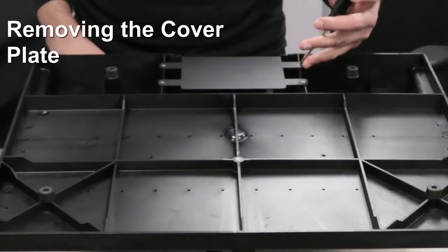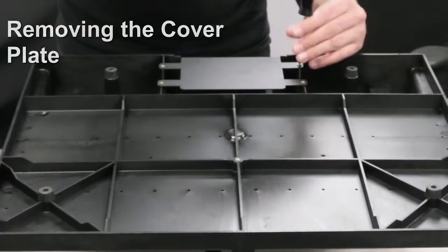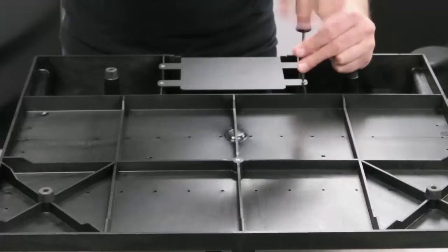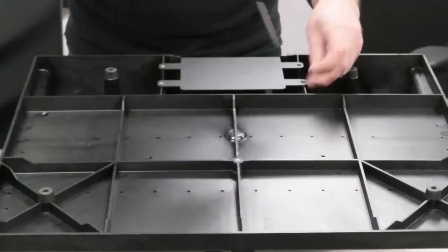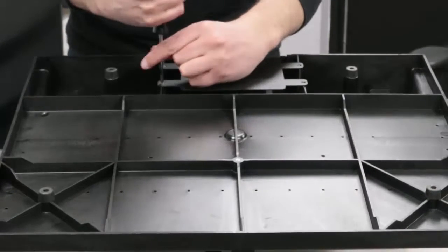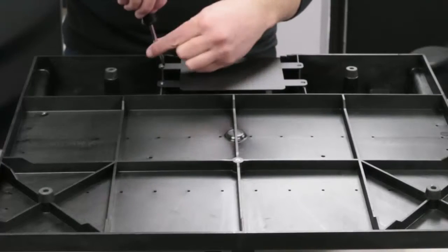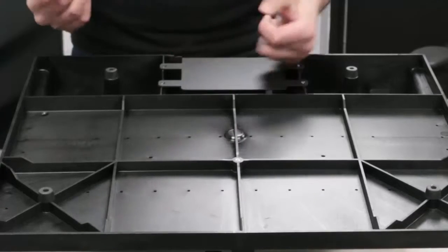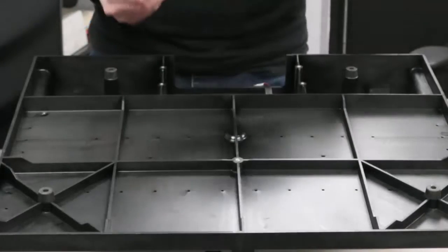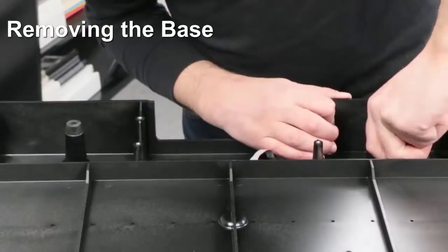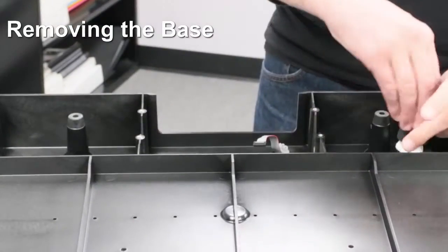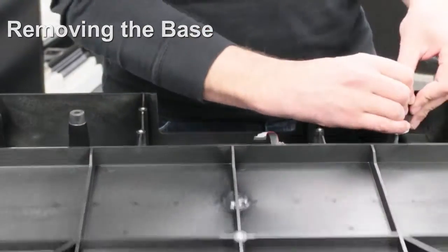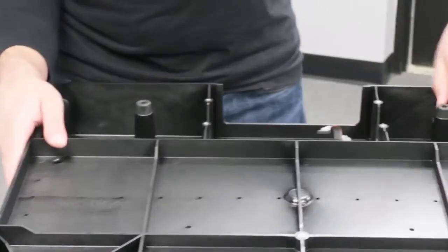The bottom cover plate is held by four screws. Next, remove the four screws which hold the base to the body of the autosampler.